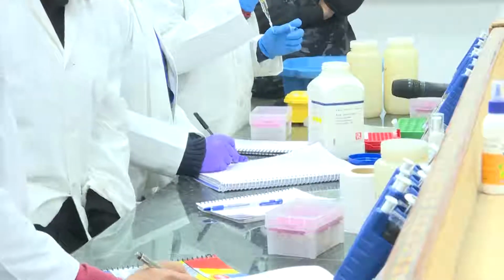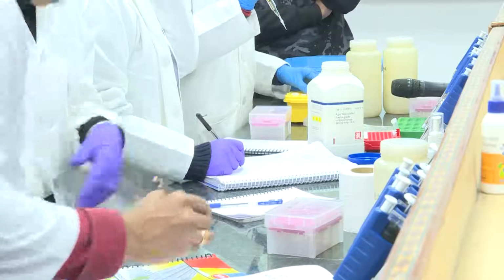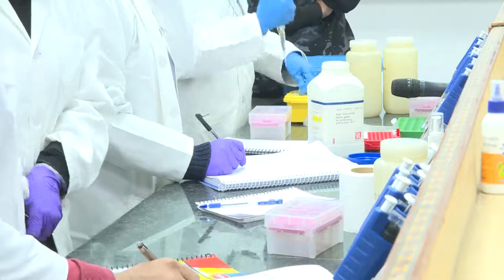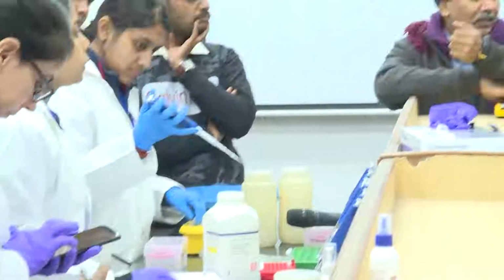When you prepare all these reagents, you always make 10% more of it, because when you handle with the pipette there could be some error, and you will run short of chemical in the last cup, which you can avoid by having more volume in the preparation.